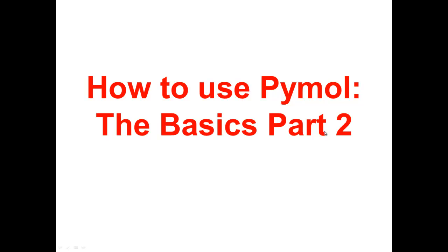In this video we'll be talking about displaying individual amino acid residues, using the measuring tool and finding polar contacts, and I'll touch on in silico mutagenesis in the end. These techniques are basic, so it will be a good idea for you to familiarize yourself with them.